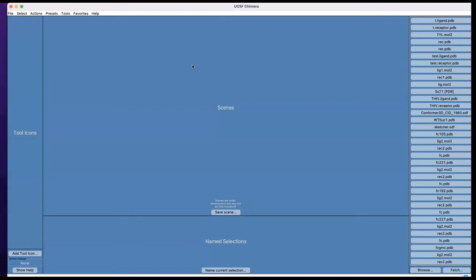To run UCSF Chimera on iOS (macOS) distribution is a bit different from how you do it on Windows. To install Chimera, it's the same way — just download Chimera like we did last time. If you are using Windows choose Windows, if you are using a MacBook choose MacBook. That's general. Now before you can use AutoDock Vina on macOS, you have to install AutoDock Vina. For Windows, once you install Chimera and have your Vina file, the Vina file alone is all you need.